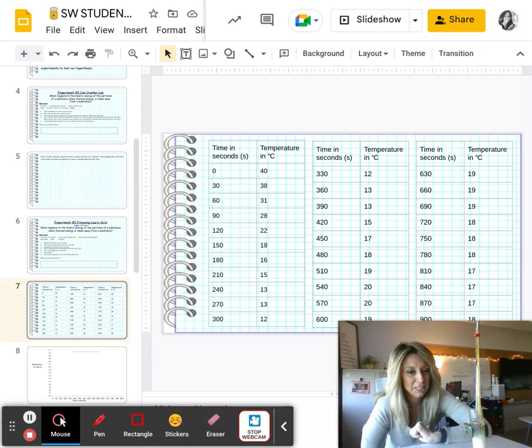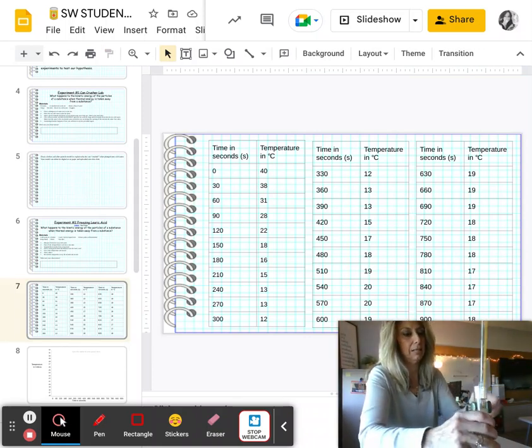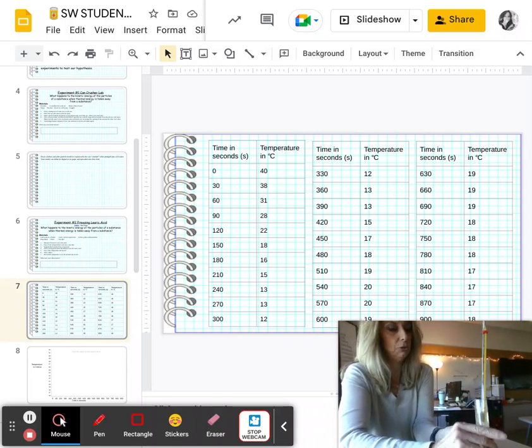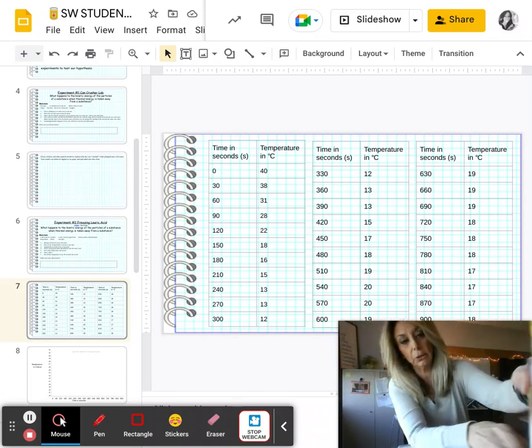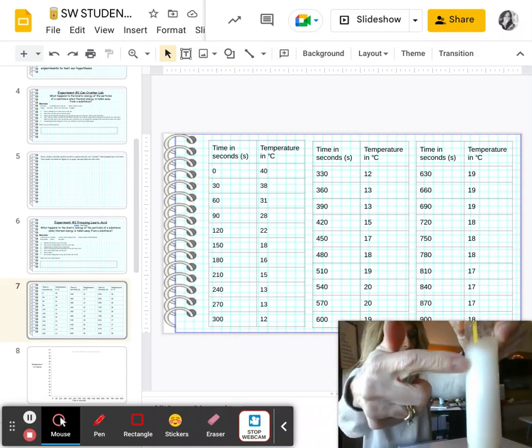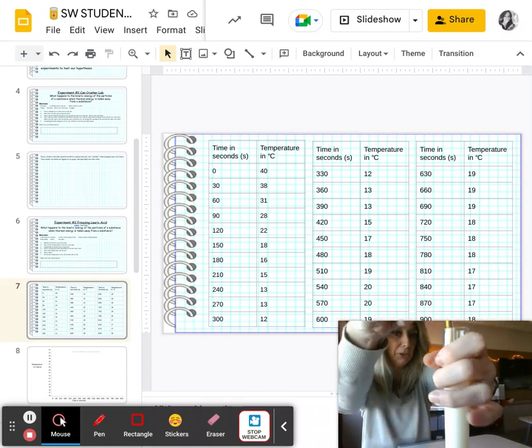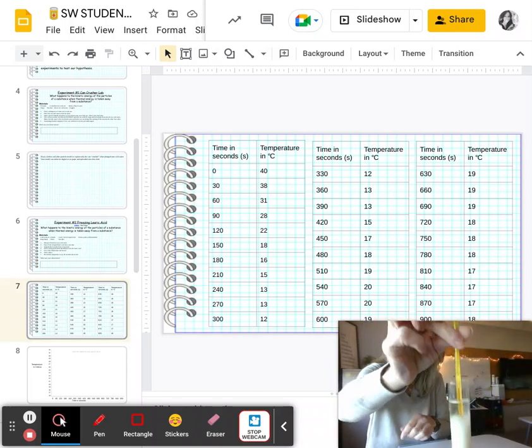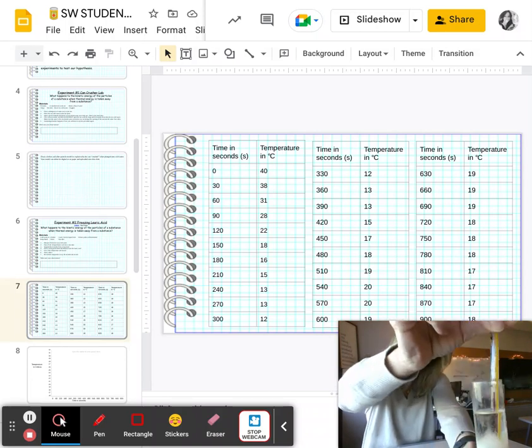Okay, so we're just going to kind of end this. As we can see, our test tube now, if you were to make observations, the lauric acid is an opaque white substance. It's solid. I'm not going to pull the thermometer out because I don't want to break it. But look, I can even hold on to it by the thermometer and it stays in there. So that's a solid substance.